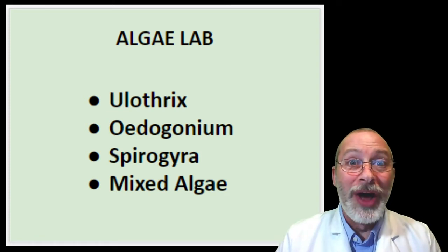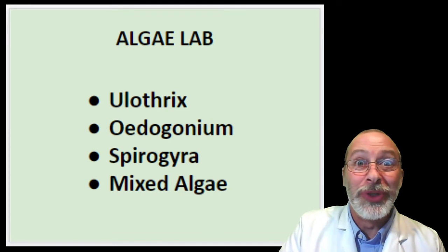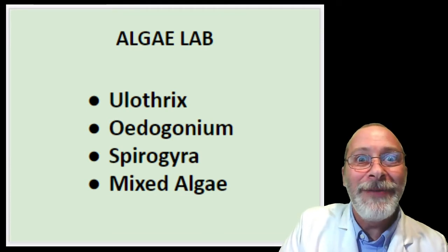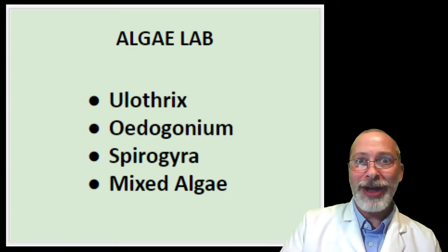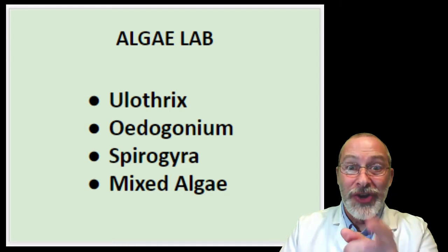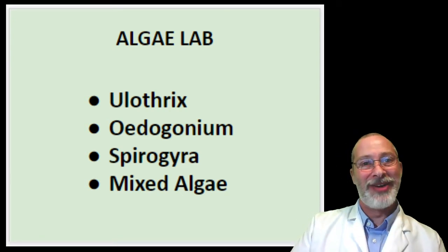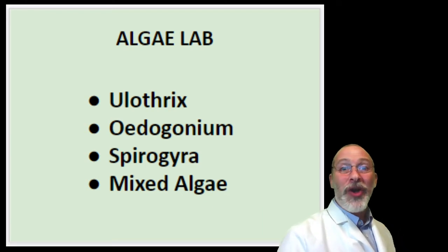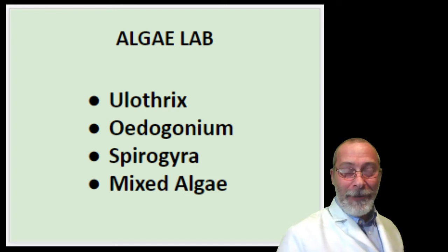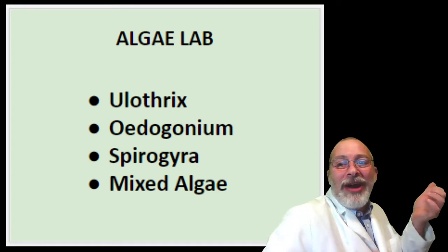Then the third one is my favorite for various reasons. Not only do I think it's cool to look at, but I used to dream about having a rock band. And if I ever had a rock band someday, I would want to name it this third type of algae because it's just so cool sounding in my ears anyway. It's called Spirogyra. Yeah, and when you say this word, you kind of have to air guitar too.